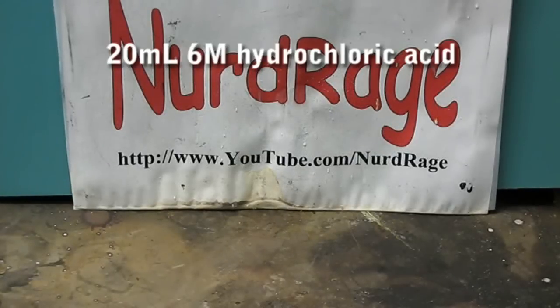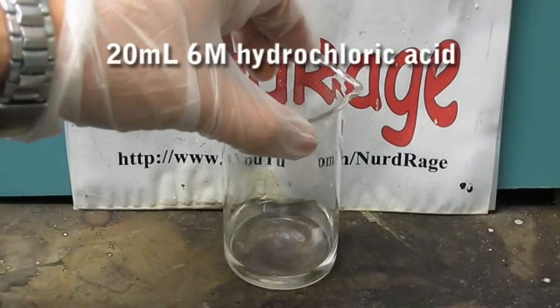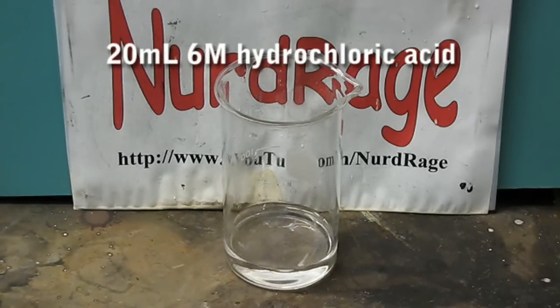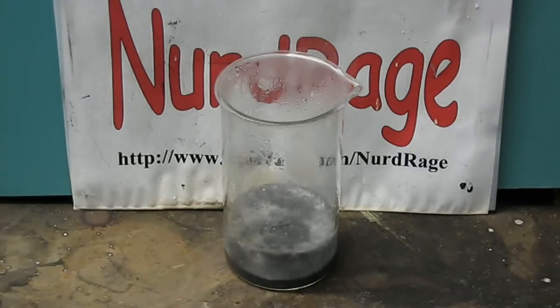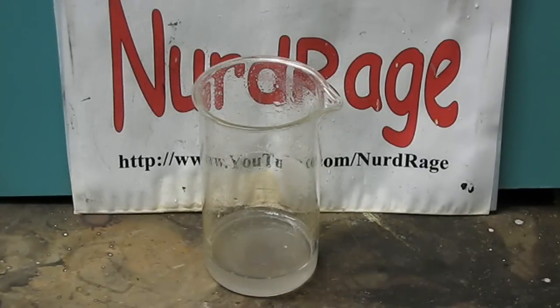First, start with 20 milliliters of a 6 molar solution of hydrochloric acid. This can be made by mixing equal amounts of concentrated hydrochloric acid and distilled water. Then drop in 1 gram of aluminum foil. As you can see, aluminum reacts very vigorously with hydrochloric acid. This will produce aluminum trichloride.